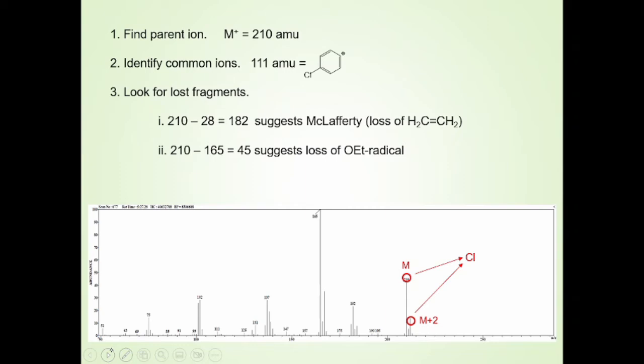And that's why we get this is chlorine 35. These are the molecules that had chlorine 37 on it. Likewise here, these would be the fragments that came from a parent ion with chlorine 35, and these smaller ones are the ones that came from a parent ion that had a chlorine 37 on it. But this is useful in that when we see that pattern, we know we have a molecule that contains chlorine, and also we can look at it and say, well, this fragment has chlorine, this fragment has chlorine, this one does not. There is no peak at 104 that's a third the size of that. So whatever this is, it does not have chlorine on it.